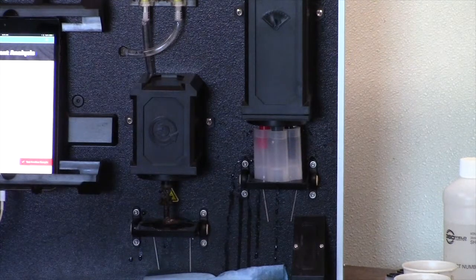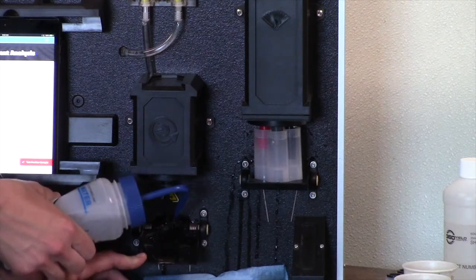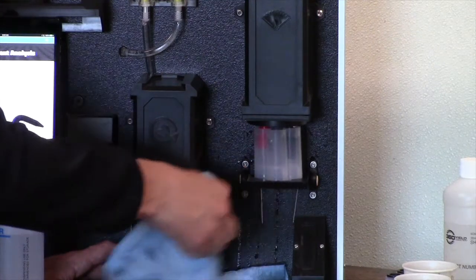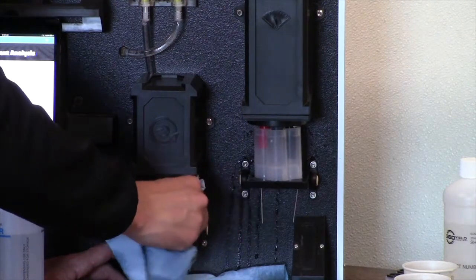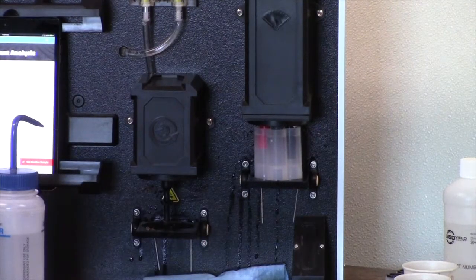You can also spray down your mixing paddle. As you can see, I still have some residual soil here. So I spray that down, and the mixing paddle itself is very durable, so you can work a little harder around the paddle itself. Once that is clean, we're ready for a second soil sample.